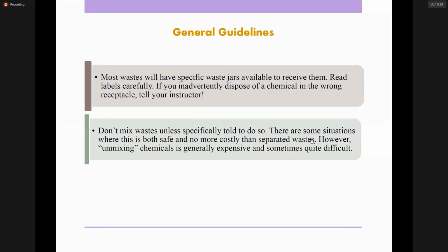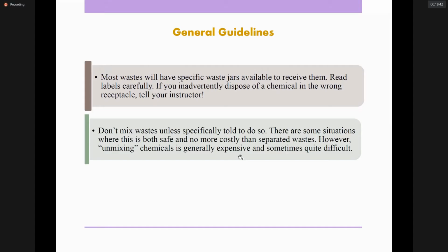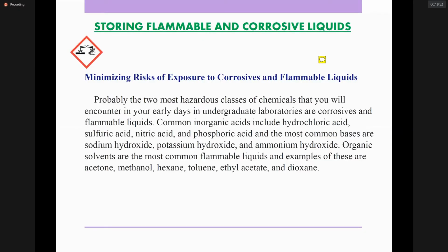There are some situations where mixing is both safe and no more costly than separated waste. However, unmixing chemicals is generally expensive and sometimes quite difficult. So separating the waste costs money too, in many laboratories.